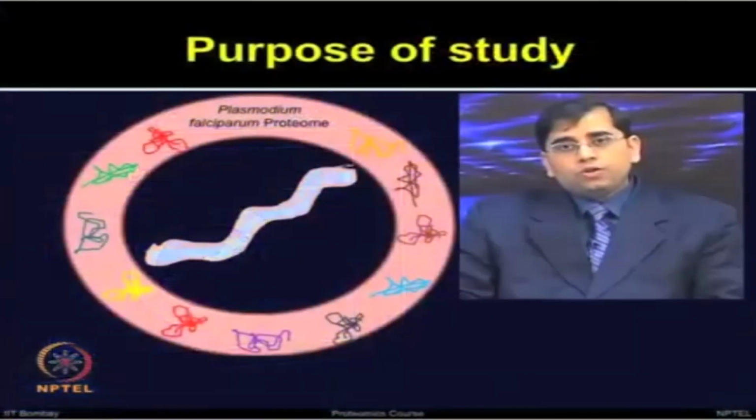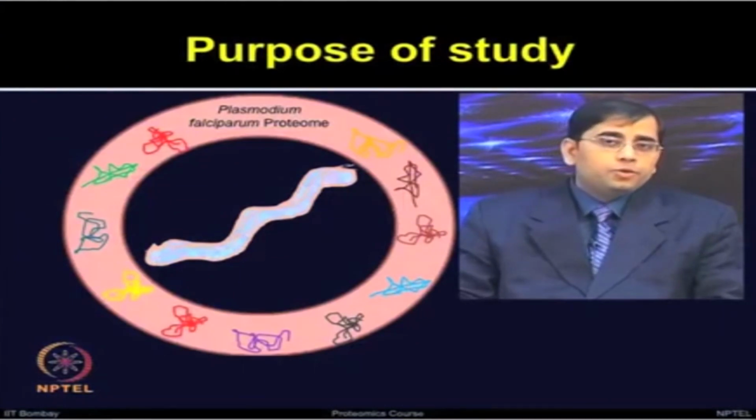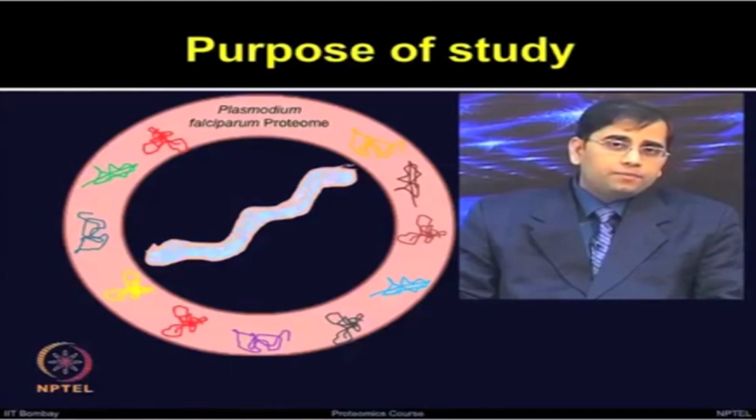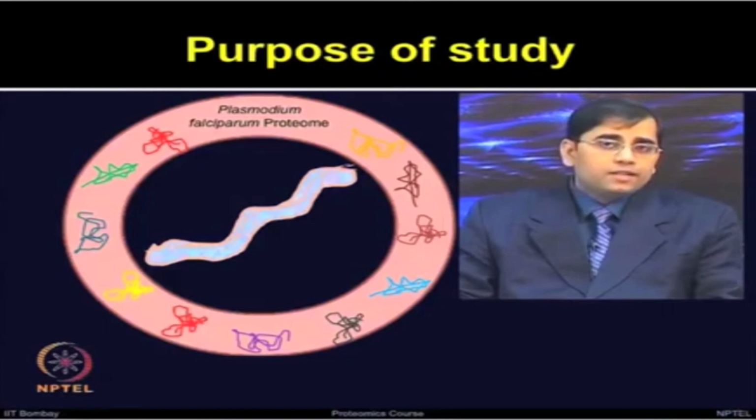To obtain insight into the proteomic alteration, they separated the proteins on two-dimensional electrophoresis gels and compared the response of these proteomic alterations based on these two drugs, and then they identified certain proteins which were either commonly expressed due to these drugs or differentially expressed.